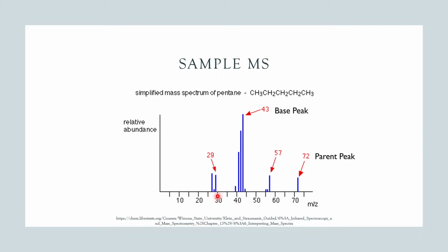None of the fragments really had any mass between 30 and, say, 38. But the next fragment that we get that gets a reading is 39. And we continue to move all the way through until we end up hitting this last peak here, an ion that can get through the electromagnet that has a mass of 72.